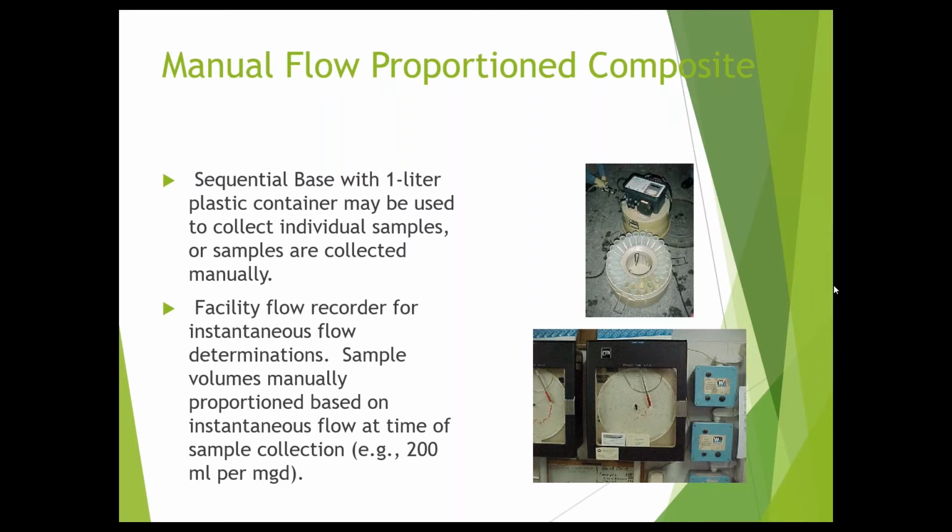If it's BOD, then it's only going to be a certain amount of time. If it's metals, then it's going to be a certain amount of time because there are different preservatives. If it's nitrogen and phosphorus, it's a certain amount of time because there are different preservatives for each one of those. Some just require ice, some require acid. So I personally, again, this is not law, when your 24-hour period is up, pour your samples up and preserve them properly. That way you have a bottle for BOD or TSS, a bottle for nitrogen and phosphorus, and a bottle for whatever's next. All of those will have different preservatives and different holding times.